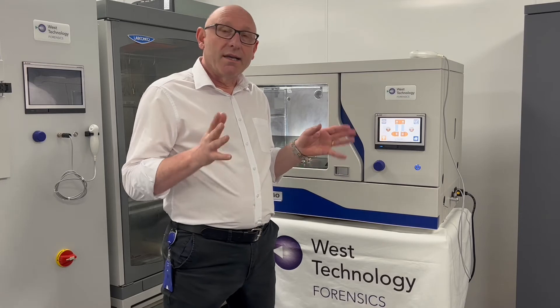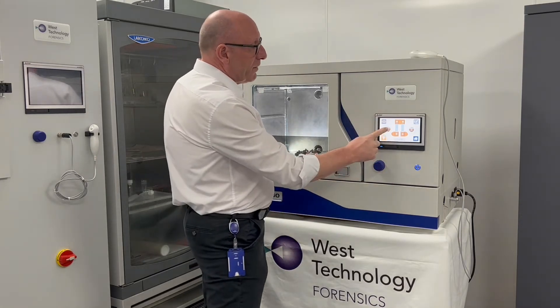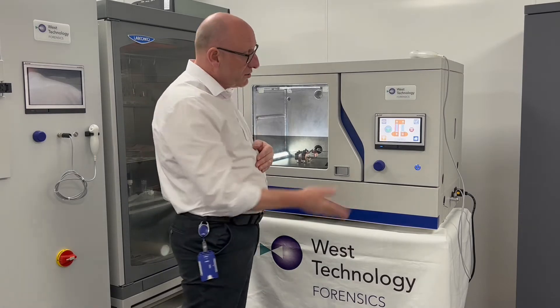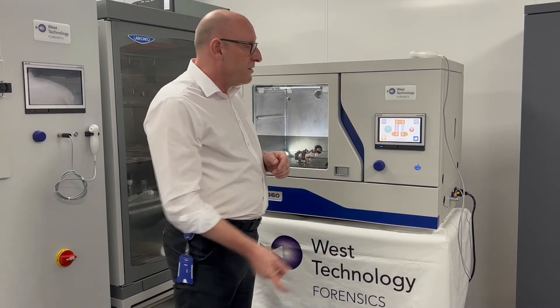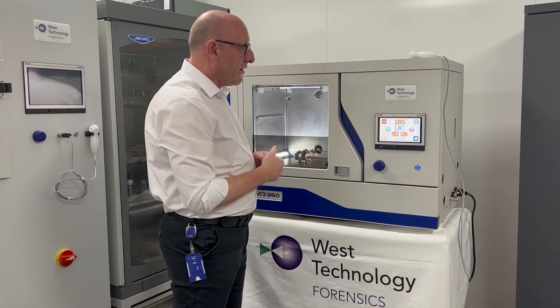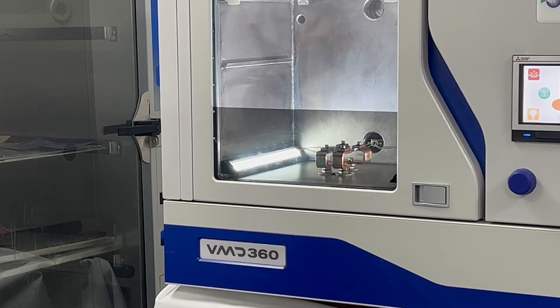The VMD 360 is now ready to carry out the process and the control screen has changed over to the processing screen. The first thing I need to do is activate the gold boat. We have two options: we can either do a manual evaporation using the control knob on the front, or we can do an automatic process. On this occasion I'm going to do an automatic one. High current is being placed through the boat and it will start to glow and evaporate the gold.